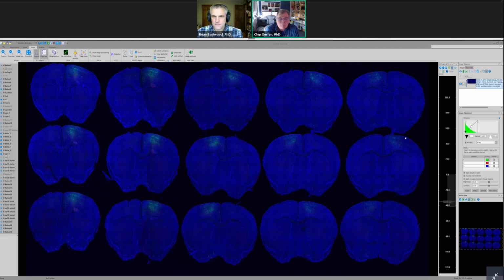And one of the things that we've been doing is to be able to reconstruct whole brains, to image those and put up information. For instance, I don't know if people are familiar with the GenSat project, the GenSat Cre project, but we went through and could image the whole brains looking at Cre expression using NeuroLucida and the NeuroInfo program. What we want to talk about today is a relatively new part of the program having to do with being able to do cell detection in these brains.